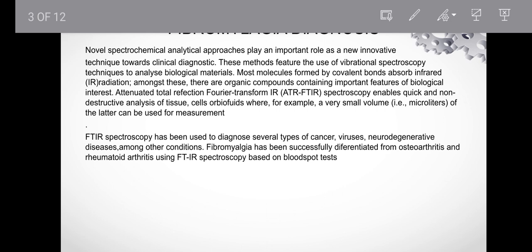In fibromyalgia detection, we use the blood plasma. The biological fluid is not saliva or serum or semen. It is human blood plasma. Every component of the human blood plasma has a characteristic peak. Every component has an individual peak, like amide, CC, skeletal COC linkage, or glycosaminoglycans.